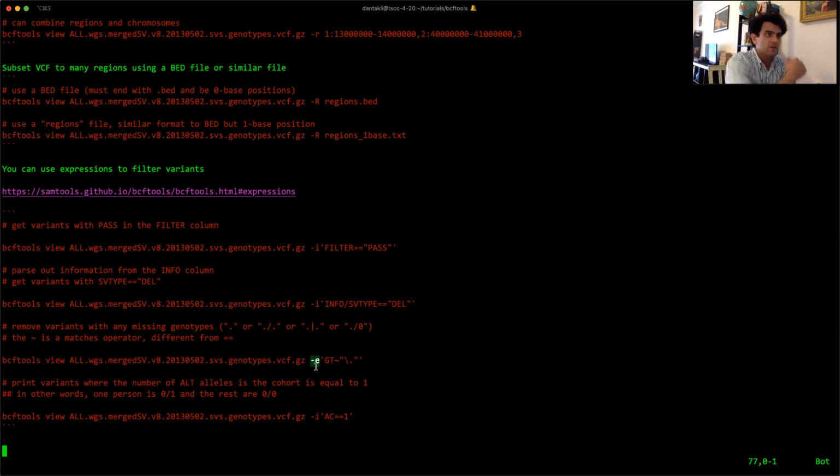And you can essentially apply the E flag, which is exclude. Now, the thing is that if you start playing around with this, you'll notice that you cannot have two excludes. I think you can chain things with the AND operator and things like that. I believe all that information is in that link that I sent.